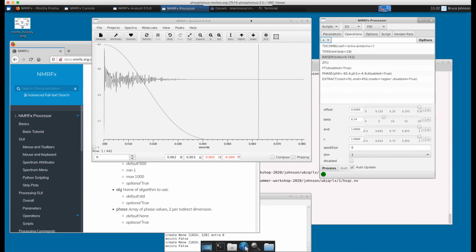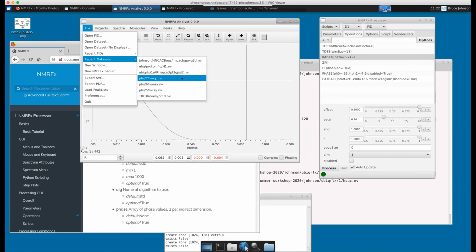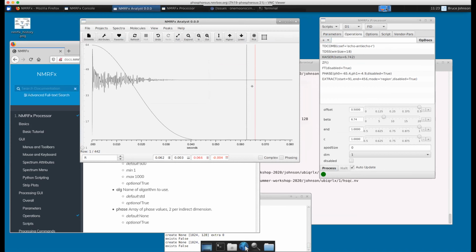Okay, let's... you've got one other hand up still, Alex. Yes, go ahead. Oh yeah, I think I missed the part where we switched to this 2D display, but maybe it's also my problem here. I feel like I'm getting some kind of exception when I hit the process button. Ah. There. I know you probably don't want to troubleshoot my particular setup, but maybe there is some obvious issue.